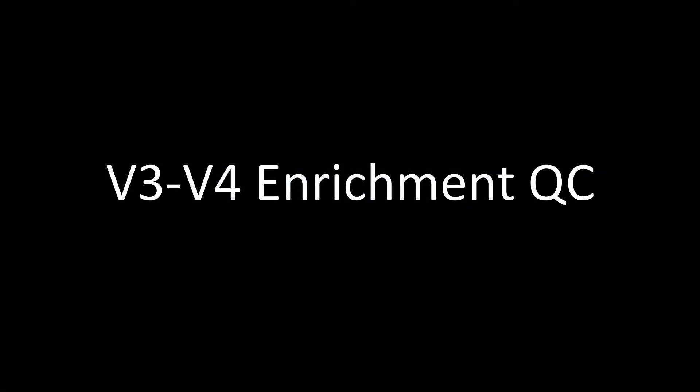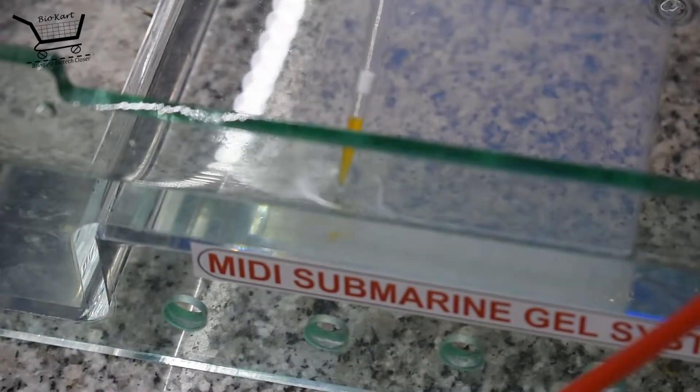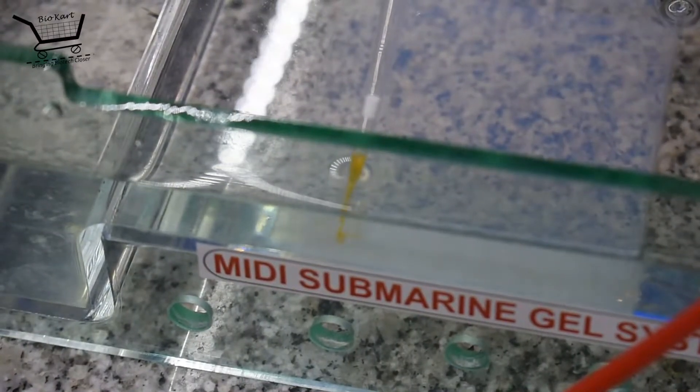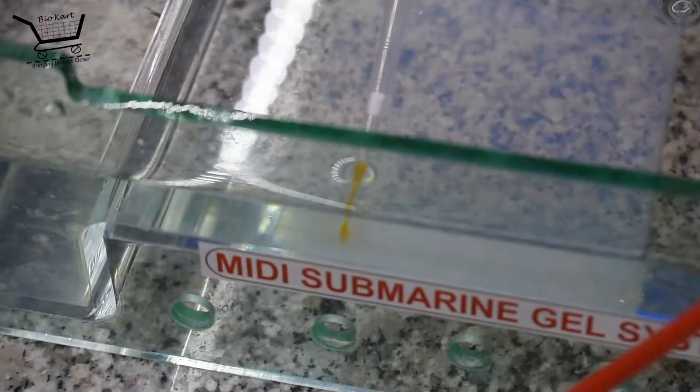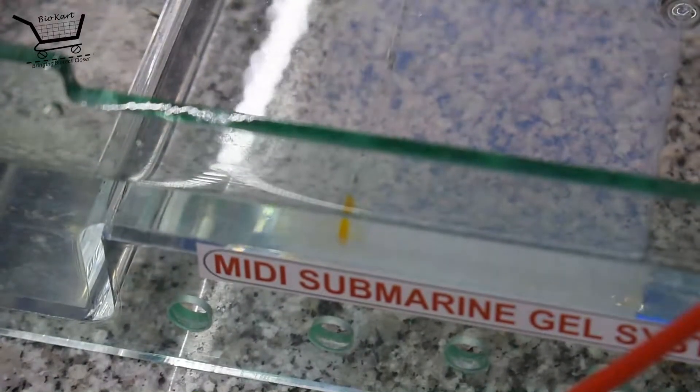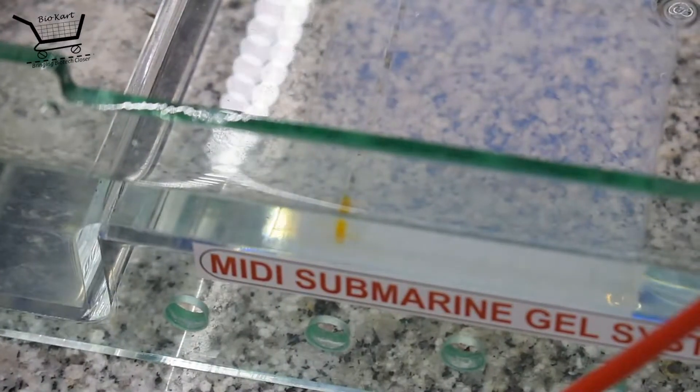Now that the amplification is carried out, we come to a second quality check stage. The PCR amplified products are subjected to a gel QC. 1 µL of the amplified product is loaded into a 2% gel along with a 50 or 100 base pair ladder.